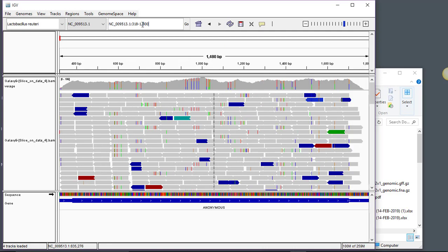So this is the figure that I'm trying to make to show all of the aligned reads for my particular region of interest. You can see that there are several variants that are being flagged by colored stripes in the histogram of the sequencing data. And this is the figure that you'll make for your first Unit 1 project. Good luck, and let me know if you have any questions.